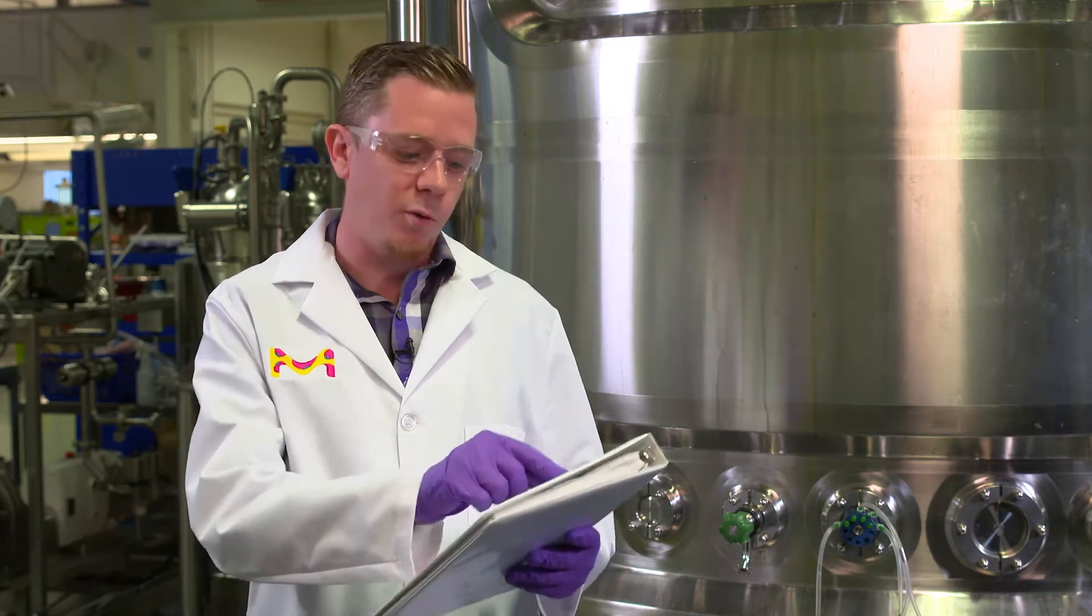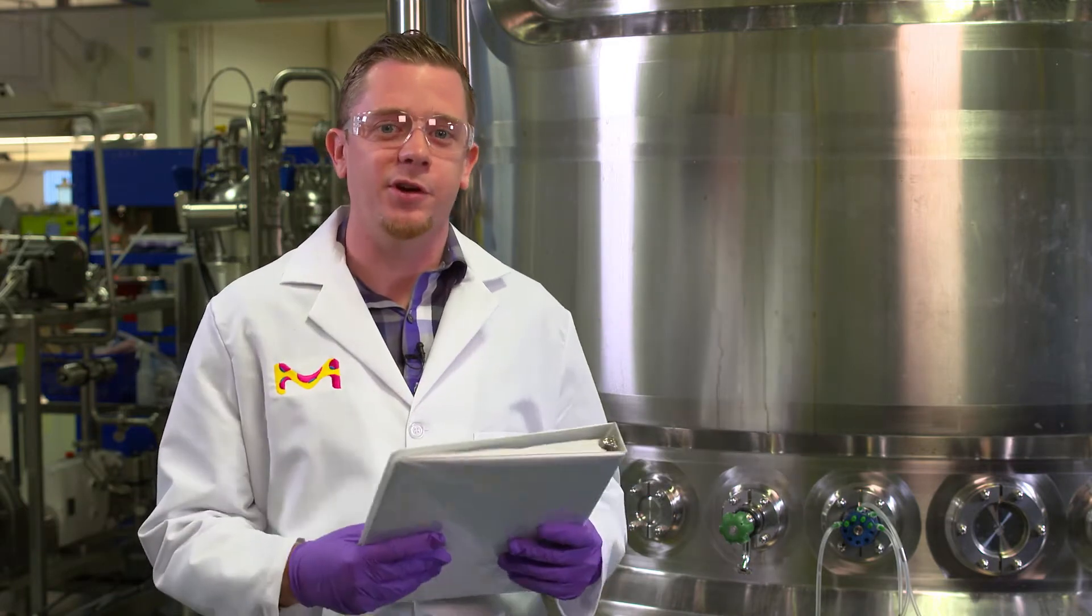Hi, I'm Mike and I'm here to talk about sterile sampling. Sampling is the best way to make sure that what you have spec'd out on paper is exactly what's happening in your process.